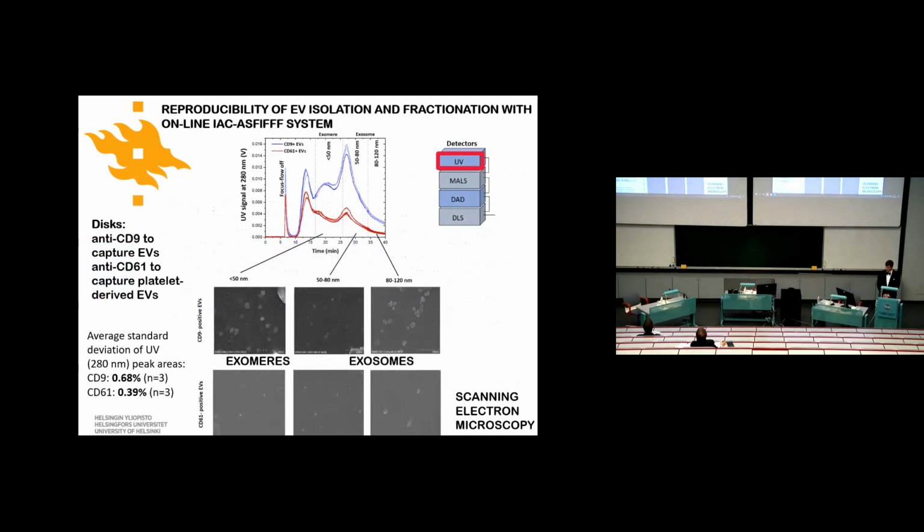Then, very important, we applied this technique also for EV isolation and fractionation. We reached very interesting results applying 2 different antibodies.